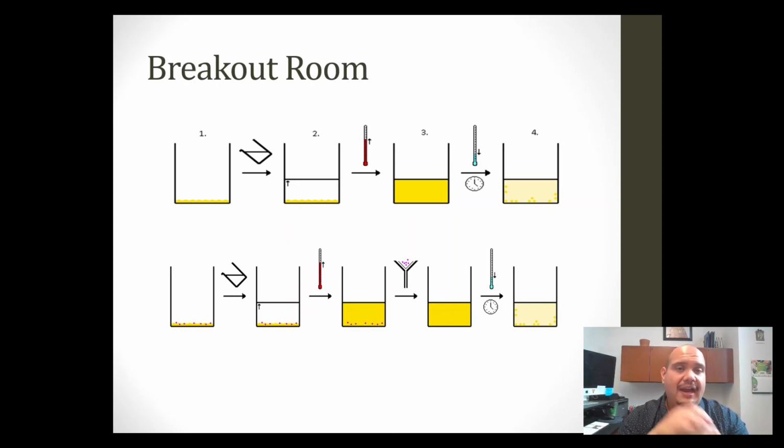If you didn't, go back and watch the instructional videos, especially the ones that show the diagram of the crystal being cooled over time or cooled rapidly, so that you can see why time is so important when you're trying to recrystallize a solute. Remember, you go low and slow on the hot plate, and then you go warm from room temperature to cold ice. The ice is only used to induce the last bit of crystal seeding that you might get, in order to increase your yield a little bit more.